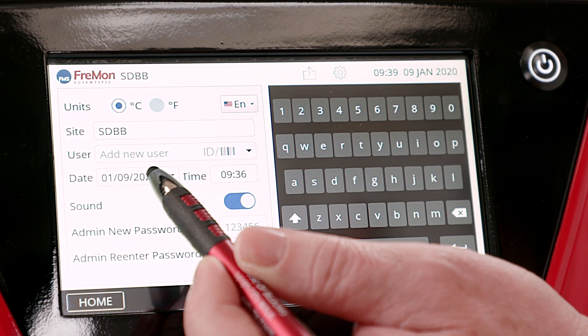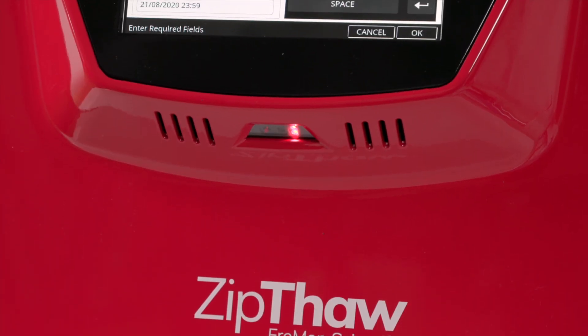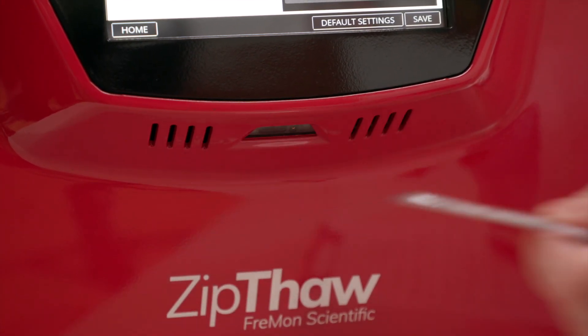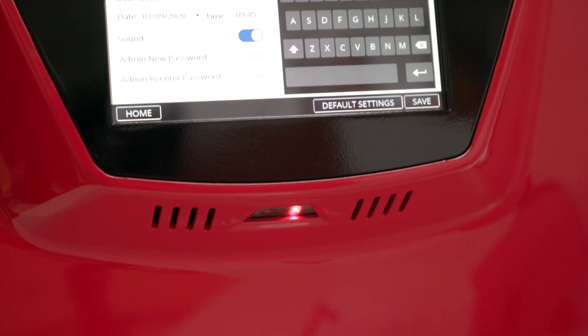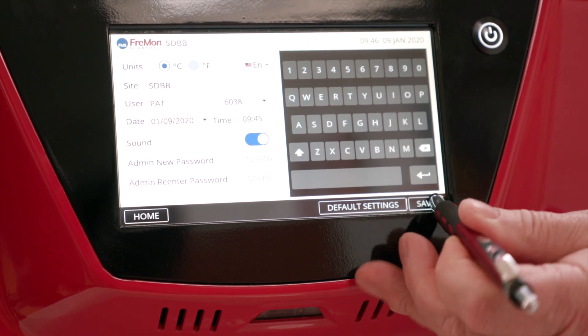Press the Users field. Now press the ID barcode icon. You'll see the barcode reader light up red. Now you can swipe their barcode ID and hit enter to confirm, or manually enter them in. I just added a name. Be sure to hit save when you're done.